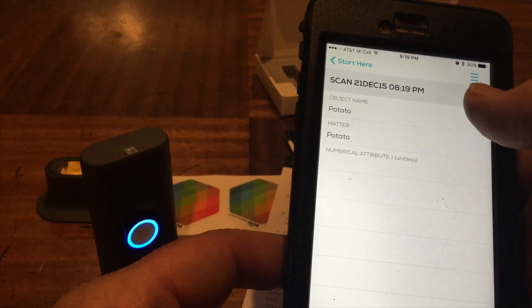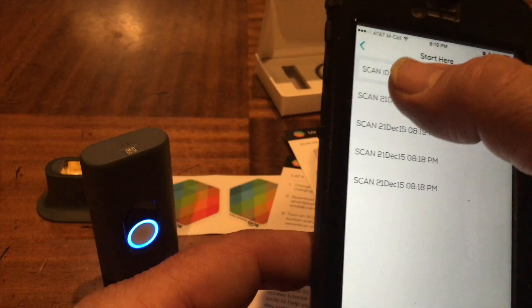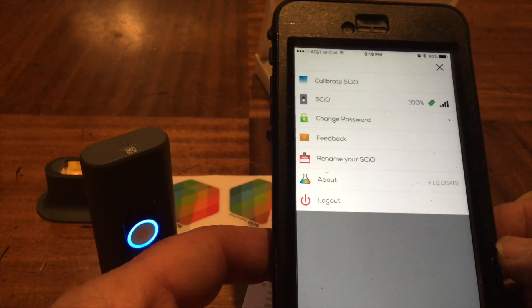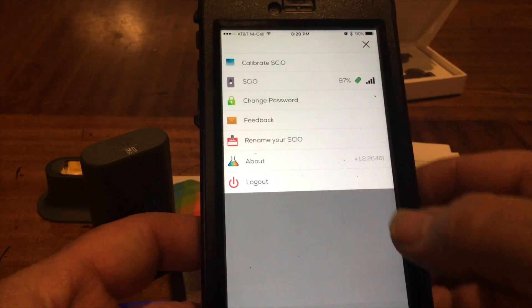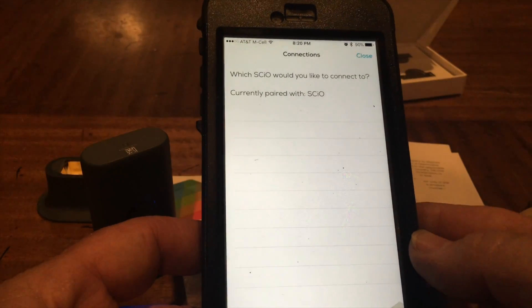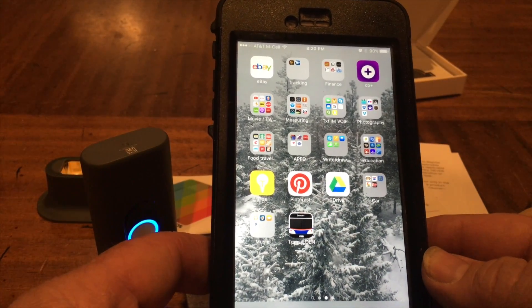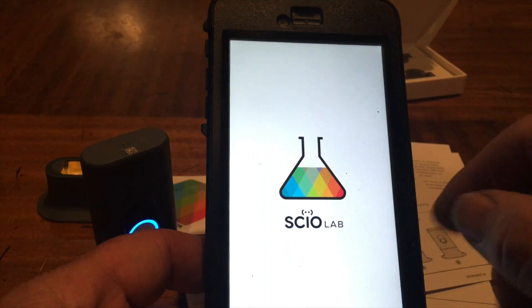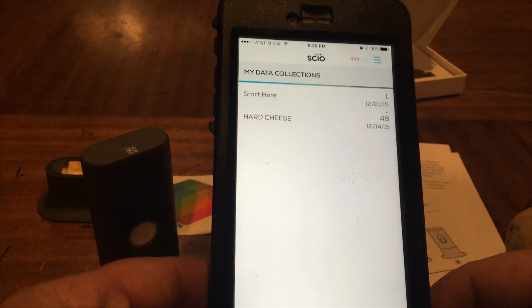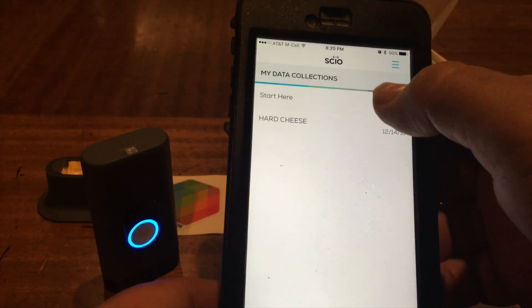I've got a whole bunch of different skins here - obviously the potato. I should probably have labeled it the kind of potato - this is a Yukon Gold potato, so I might have to go back and change that. The app crashed - where was that? Okay it started flashing saying it's not connected, but it connected right back up again. Might add a collections.